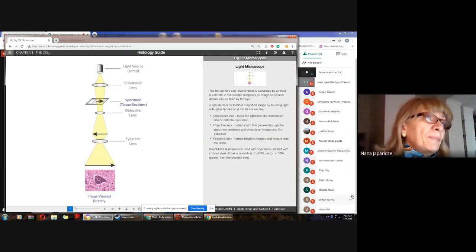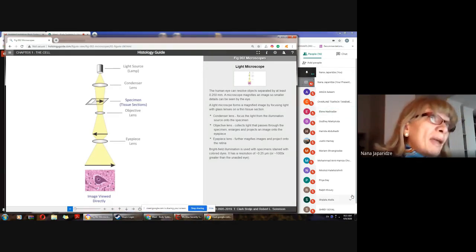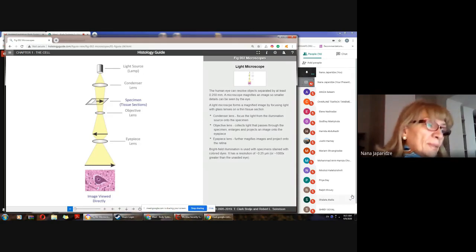When this is ready and has undergone drying, we can stain this tissue sample. Without staining, the details of the tissue sample are not so easily observable, of course. We have unstained tissue samples, for example, in the case of live tissue samples.